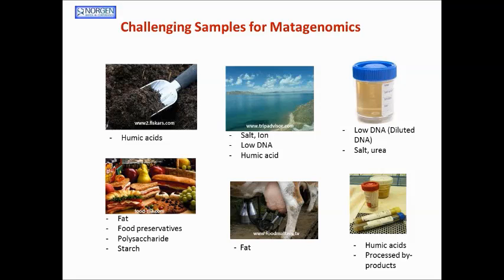Here are common samples where most metagenomics studies have been conducted, and I would like to share some of the challenging issues for DNA extraction from each sample. So, the soil case, most people are very well aware of that.